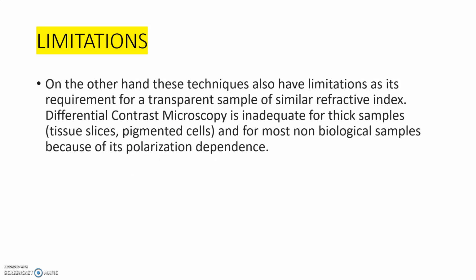Next is about limitations. These techniques have their own limitations, such as the requirement for a transparent sample of similar refractive index. It is quite difficult. And it is inadequate for thick samples, only useful for thin samples. They are also not useful for most non-biological samples because of their polarization dependence.